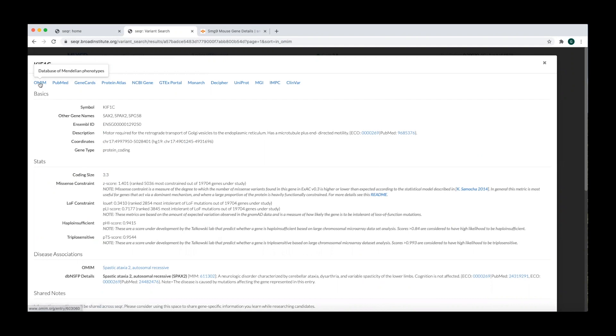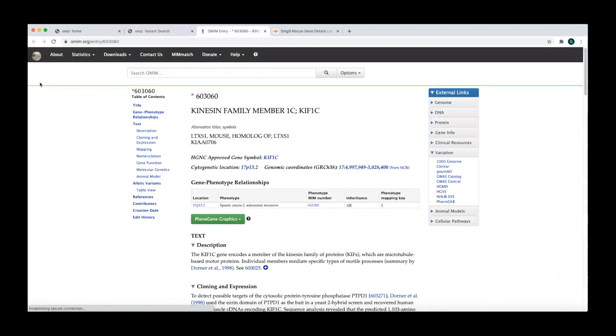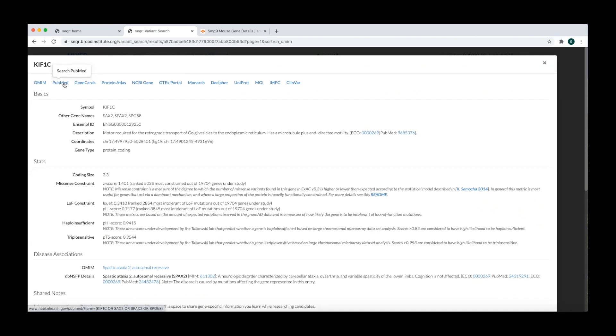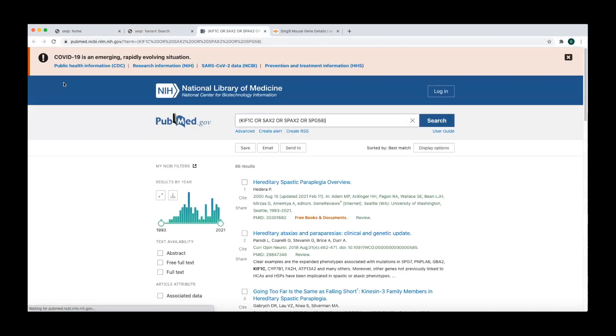Clicking on the OMIM link will bring you to the OMIM entry for the gene. Clicking on the PubMed link will initiate a search for literature referencing the gene of interest. This search automatically integrates other names used for the gene.